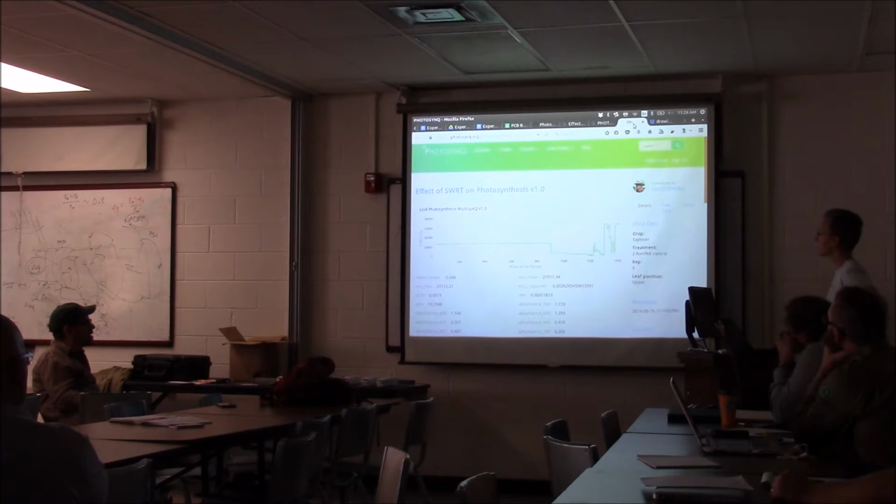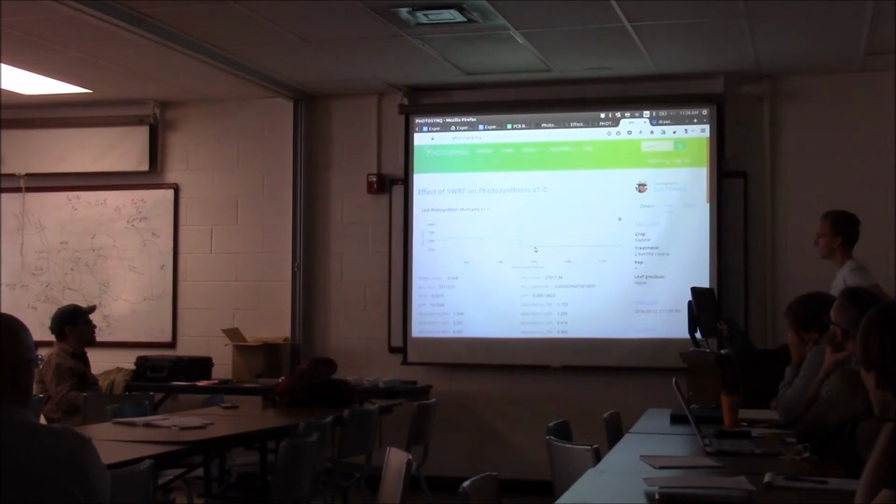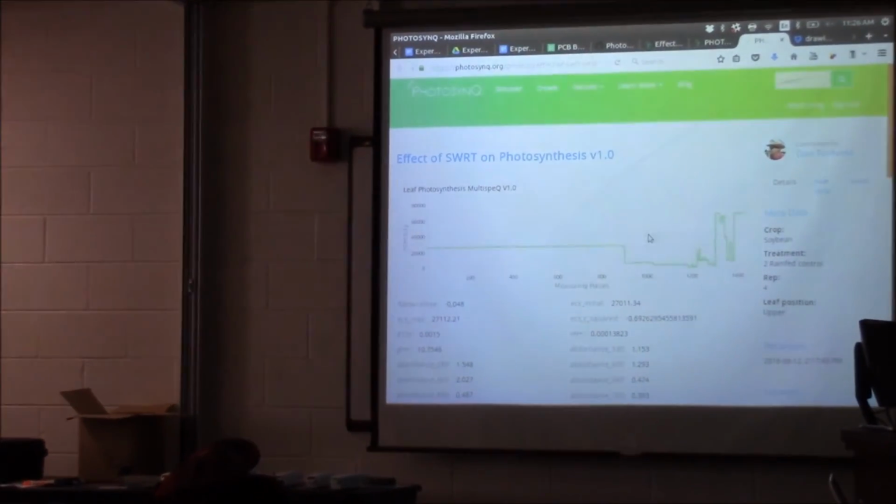I'm just going to quickly show you the exact same portions of the trace at high light conditions. Now all of a sudden you can see you're already almost at saturation because the ambient light is close to saturating light. So now this FS is really high. But after the far-red and dark adaptation here, you see that FS in the dark is quite low. You'll see that every time.